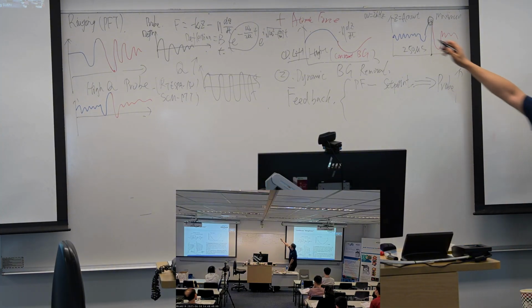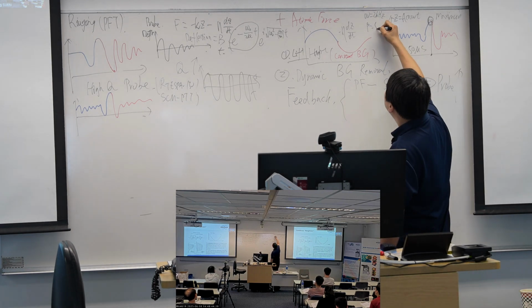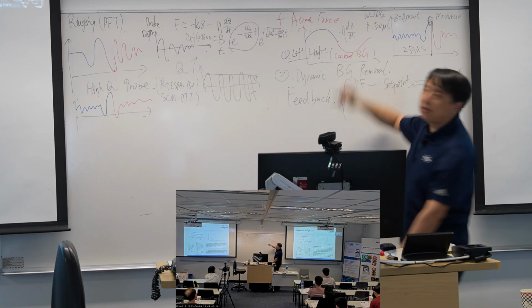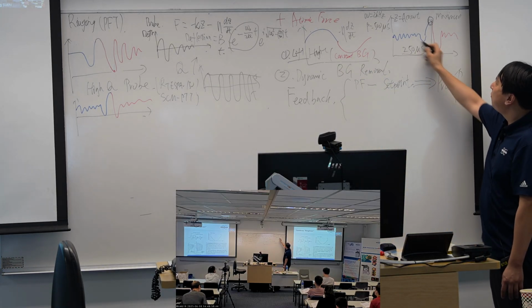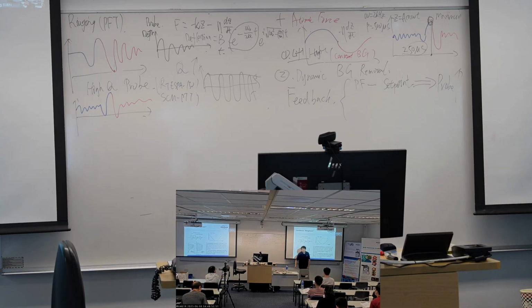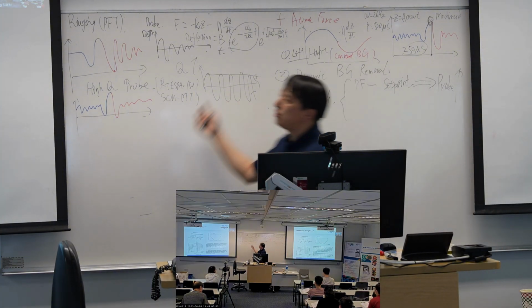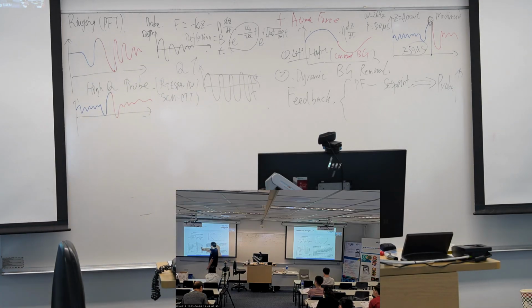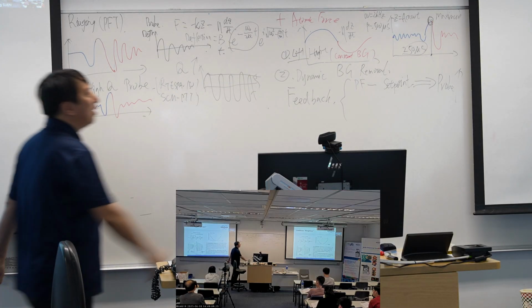Then I don't need to worry about using some mechanism to find the maximum force. No, I won't do that. I just read the force at a fixed time.